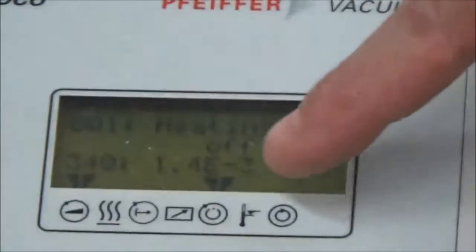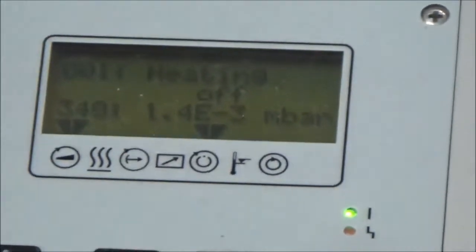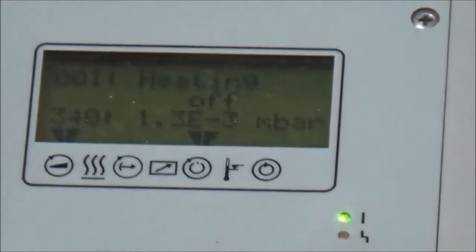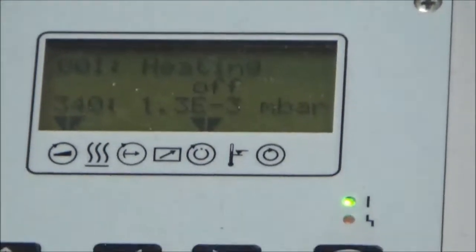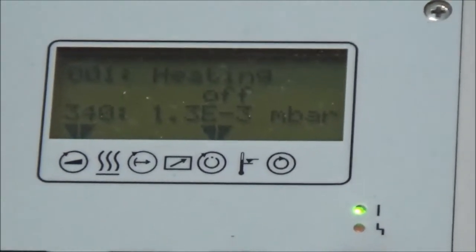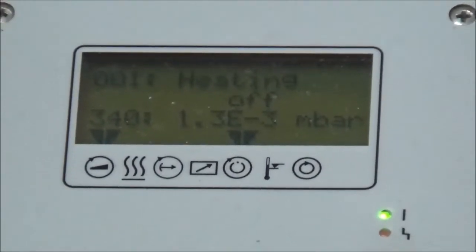Okay, this little thing means the TMP is at full speed rotation. So this is now in full operating mode. And you can see the pressure's getting pretty low here. We're at 1.3 times 10 to the minus 3 millibar.